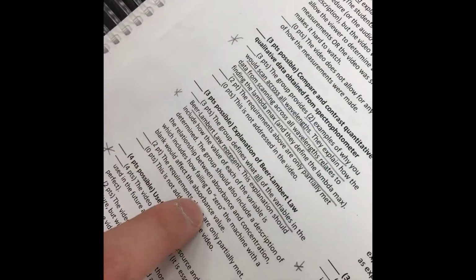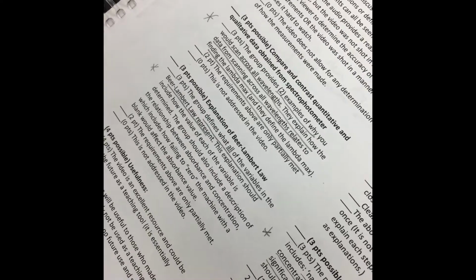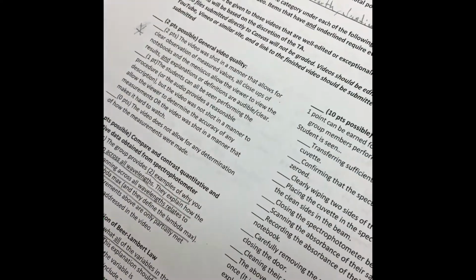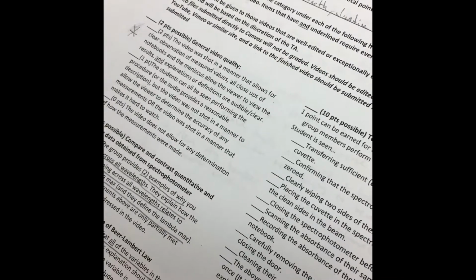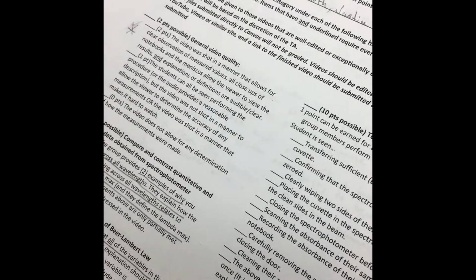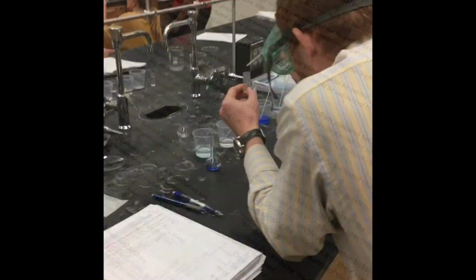So the issue that occurs when failing to zero the machine with a blank is that you get incorrect absorbance values. When you zero the machine, you take out the account of a pure water sample, which means that whenever you measure after you've zeroed on a blank, it's only measuring the absorptivity of whatever is in the solution. So if one fails to zero with a blank beforehand, then the values won't be accurate to only whatever is in the solution.